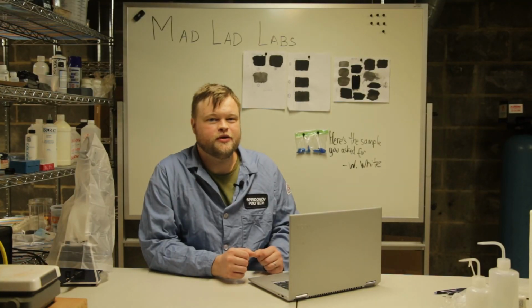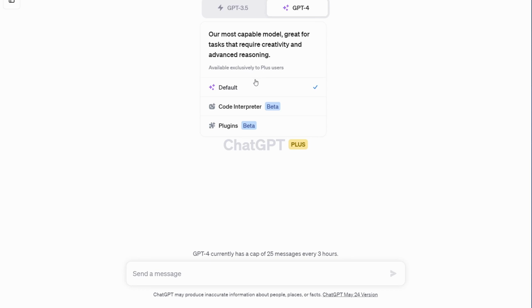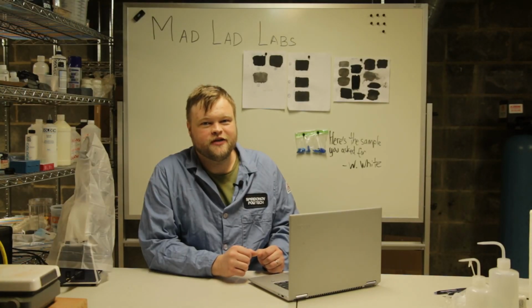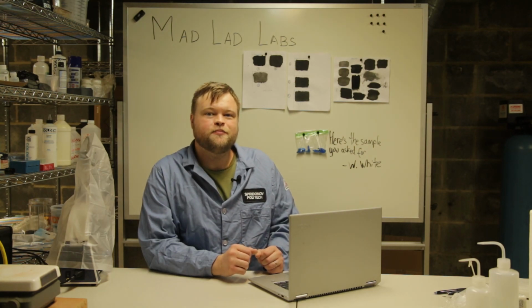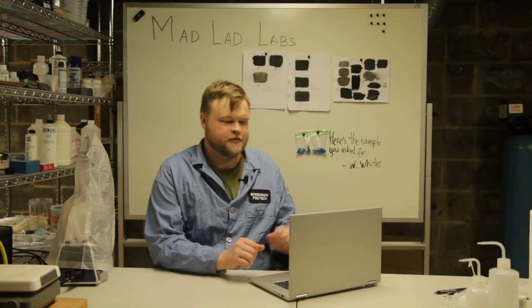Today I wanted to do a quick demo of a new ChatGPT beta feature called Code Interpreter for quick lab data analysis. Quick spoiler alert, it's not perfect yet, but personally I was very impressed and I can't wait to see the next iteration of this feature.